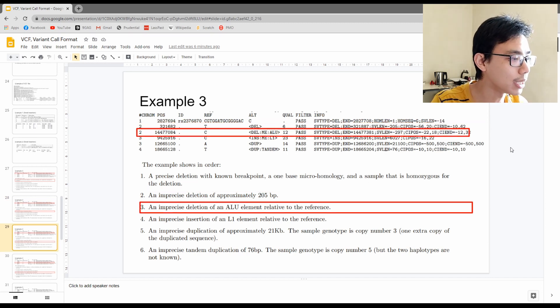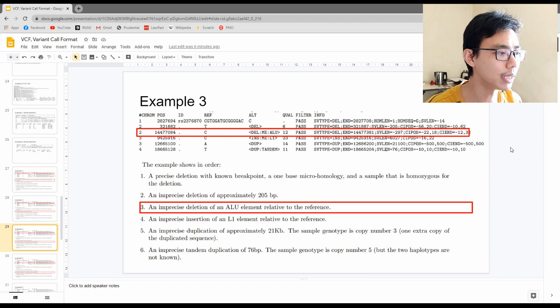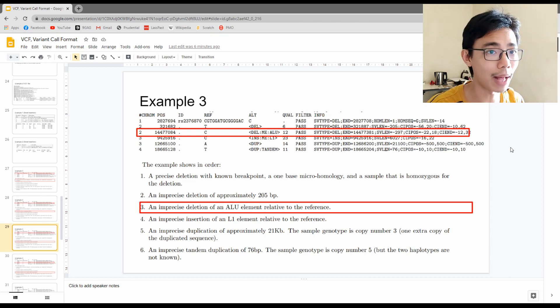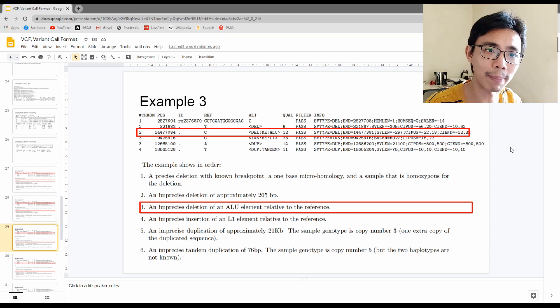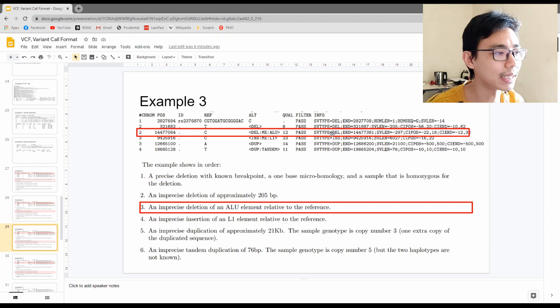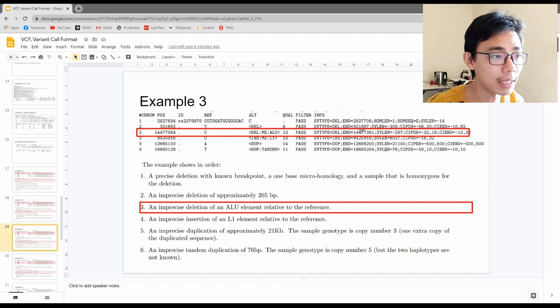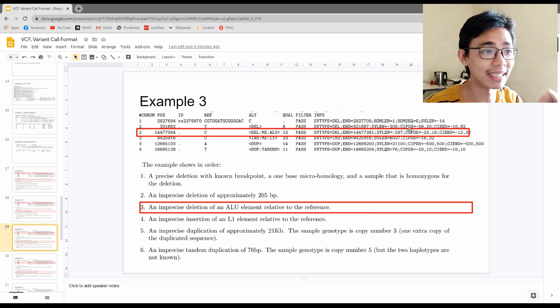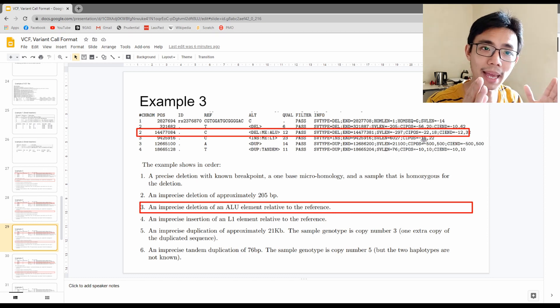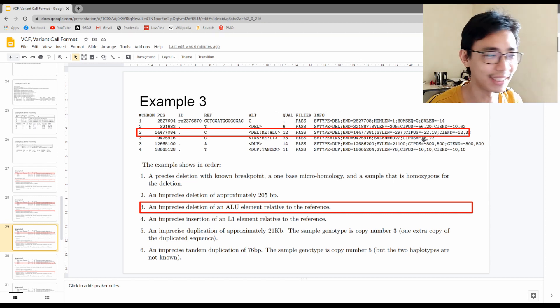The third scenario is very similar — it is a deletion of an ALU element. An ALU element is part of the transposon family and is around 300 base pairs. You can see this is a deletion of an ALU element with a length of minus 297, meaning 297 base pairs have been deleted from the sample compared to the reference.